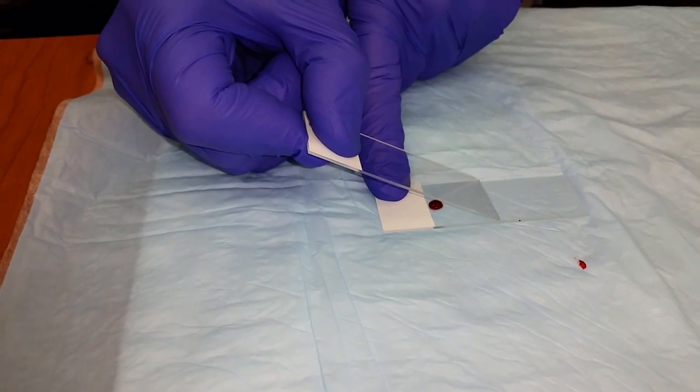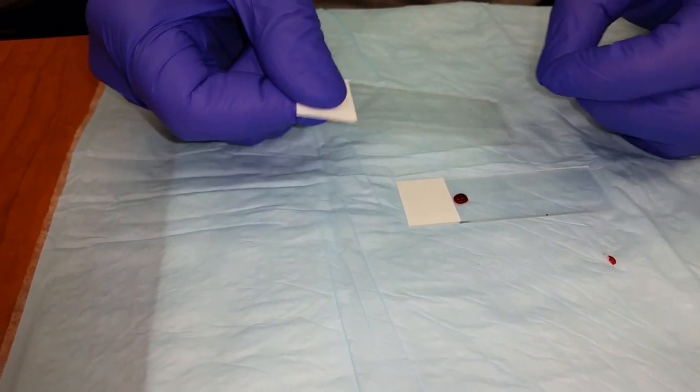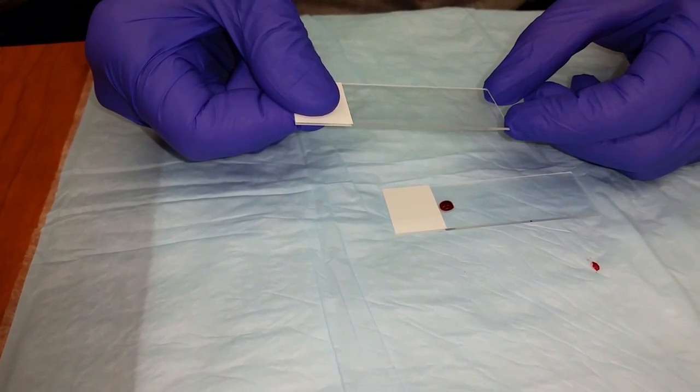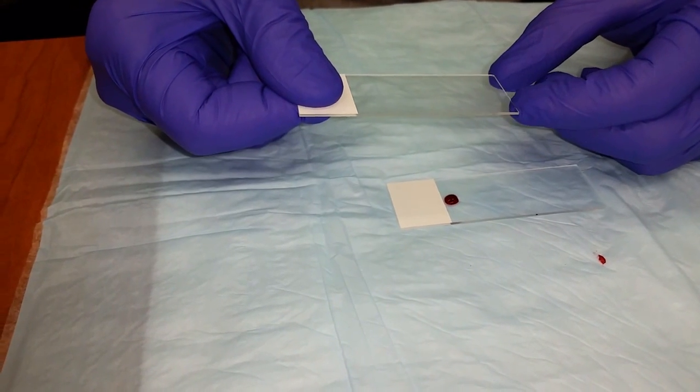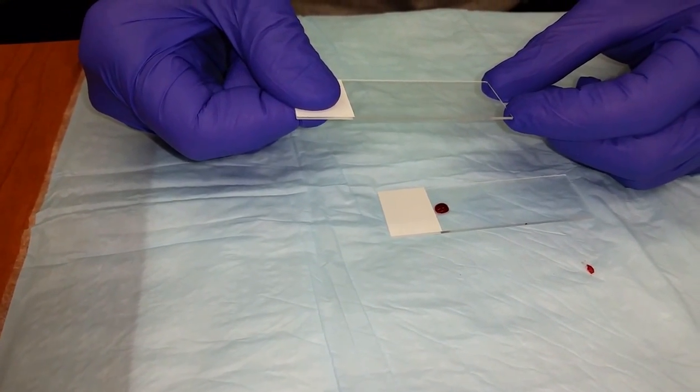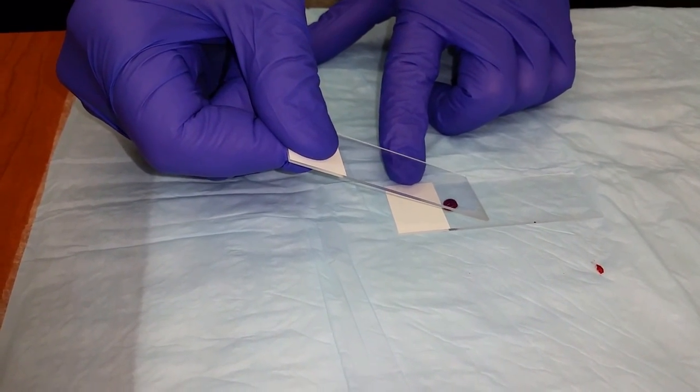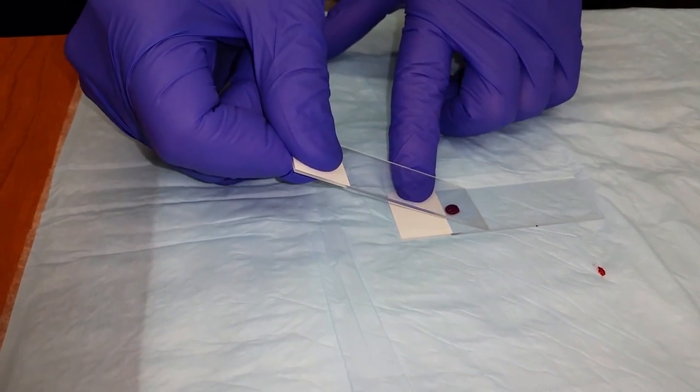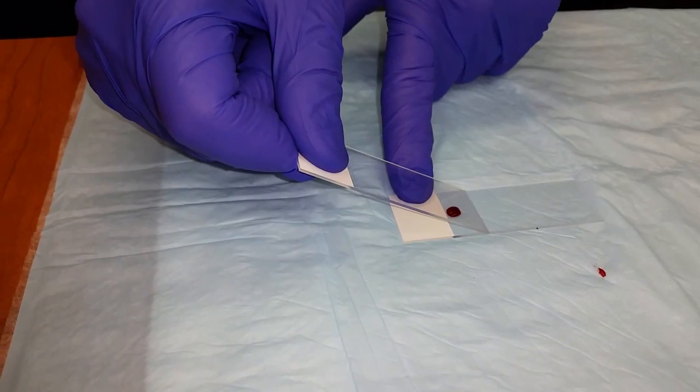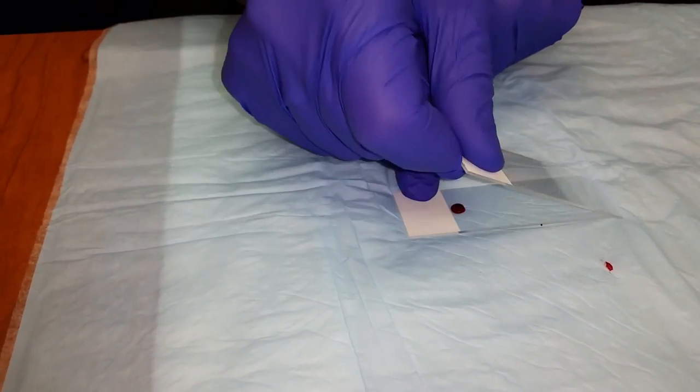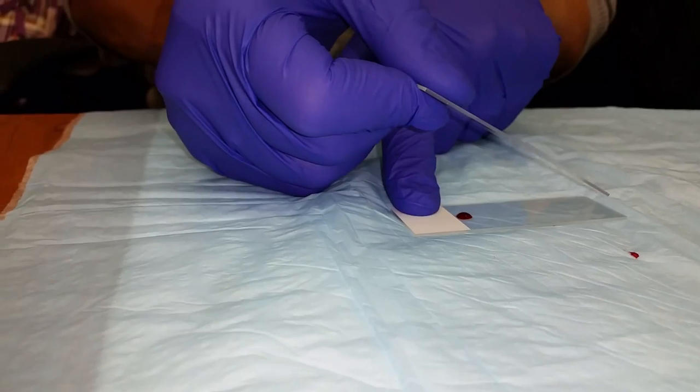And when you reach the drop of blood, you will see that the drop of blood will start to spread along the bottom of the slide. When it's spread to almost the entire width of the spreader slide, you are going to, in one steady, quick motion, keeping the spreader slide flush against the bottom slide, bring the spreader slide all the way to the end of the bottom slide.